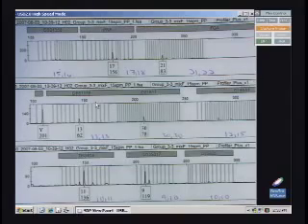Does that make sense? It's kind of convoluted. I'm sorry to say that group 2 did not get any results. Group 3, let's see, who's group 3? I think a lot of groups, when it came to evaluation, they're already sent away. It's been a while since I've worked on a CE. Can there be preferential injection of the standard?